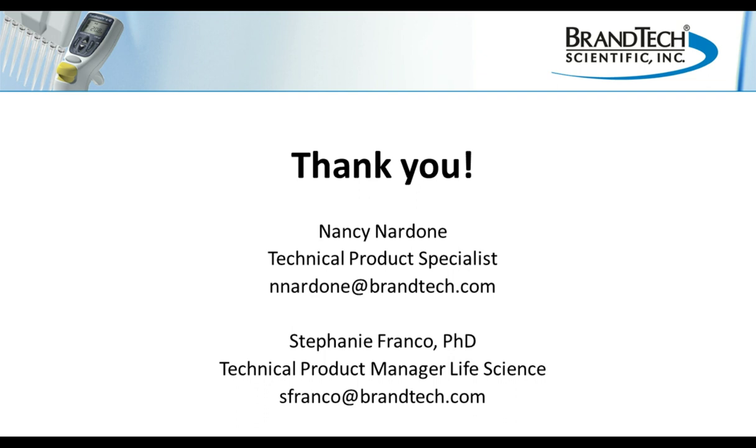Great, thank you. Does the automated liquid handler have a wash station available to wash tips? No, our system does not have a wash station. You do have to use new tips. It's not capable of washing them.